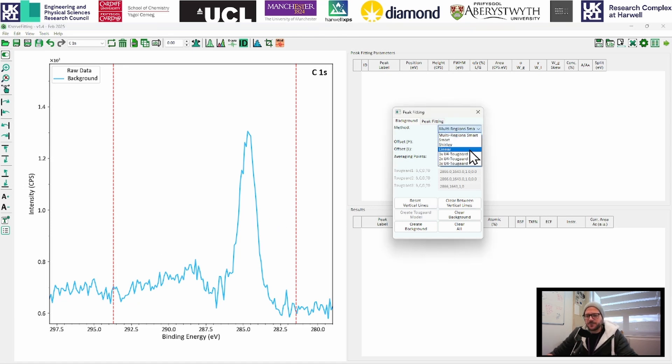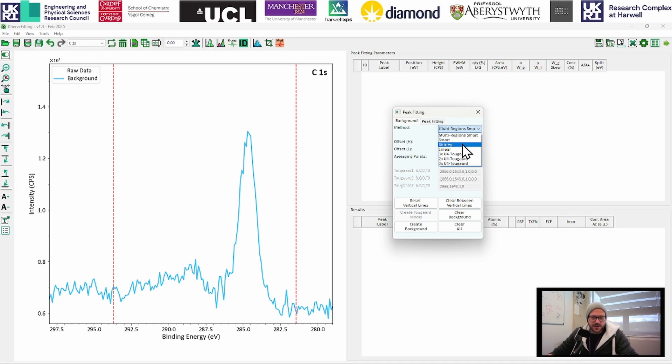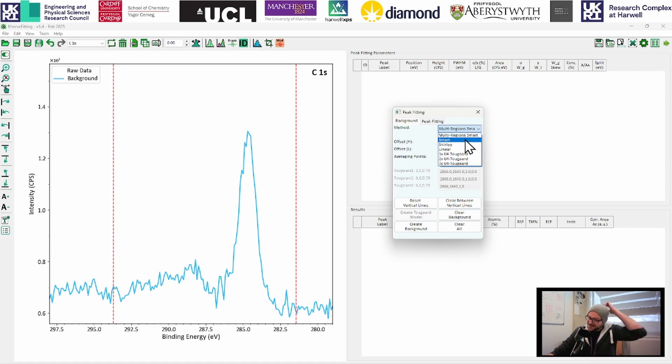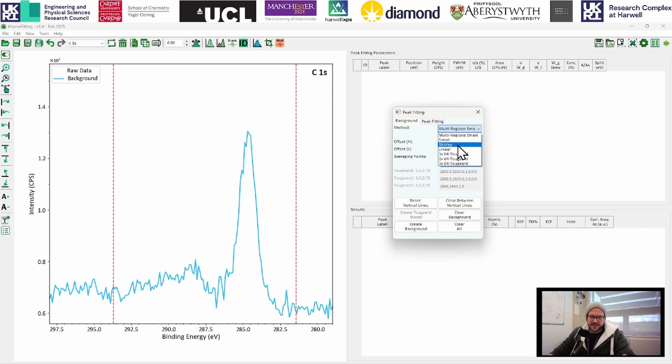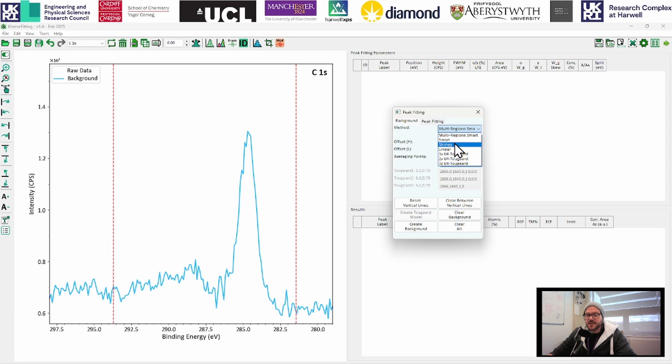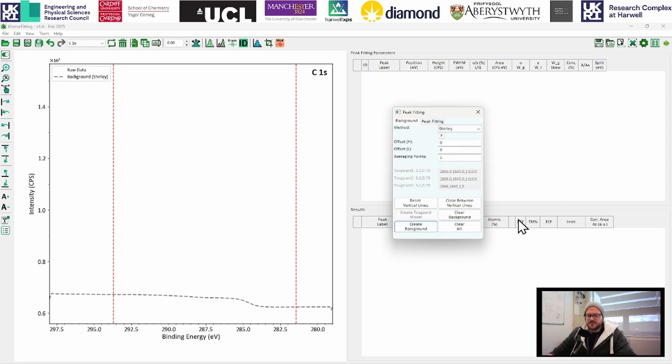We can stick in a few different region types. Typically, when we're using CASA, we might stick to a Shirley background. These smart backgrounds, they operate on the same principle that they do in Avantage. So feel free to use those if you are familiar with those. Otherwise, you can stick to a Shirley and behave in the same way that it does in CASA. And you also have the two background options here. So I'm going to stick with a Shirley to start with. And we're just going to create a background. And everything's gone.